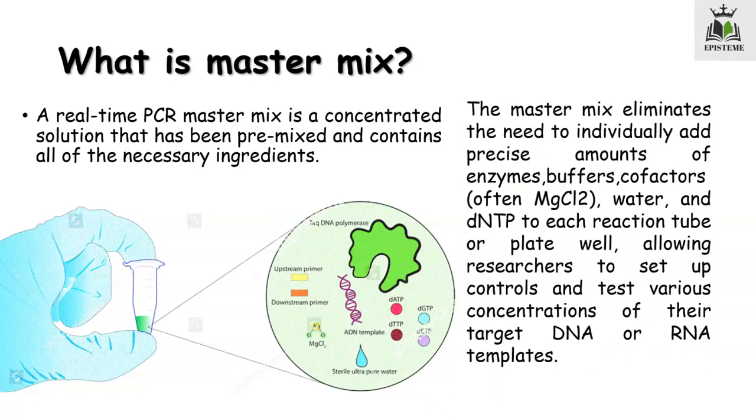The importance of the master mix is that it eliminates the need of individually adding the precise amount of the enzymes, buffers, cofactors, etc., and thus it saves the time and the effort of the researchers.